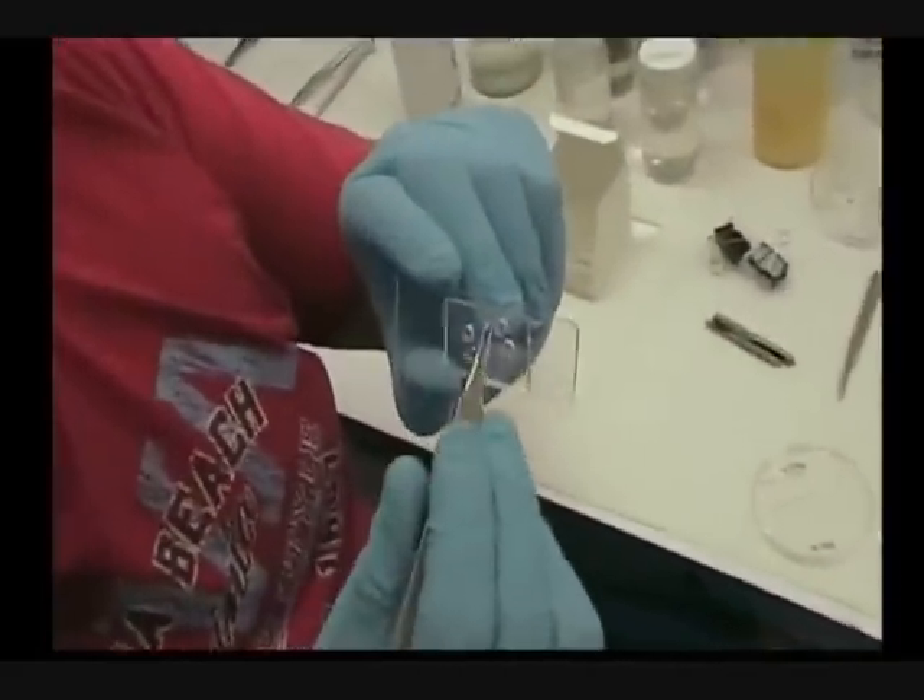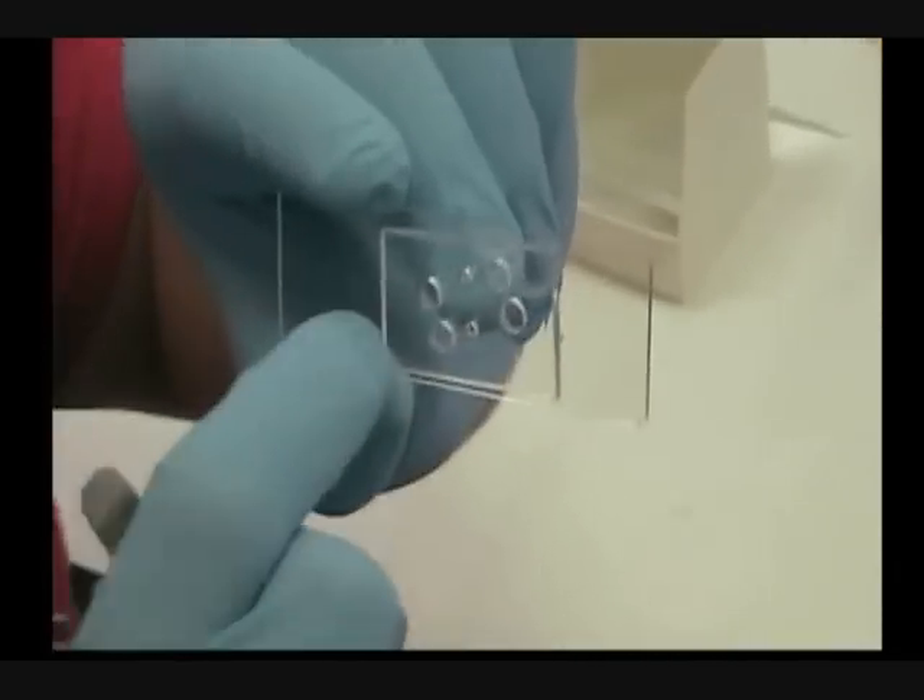Now I have the openings for the reservoir and I have the openings for the electrodes. Now the next step is to install the electrode.